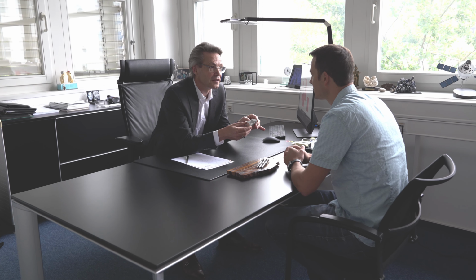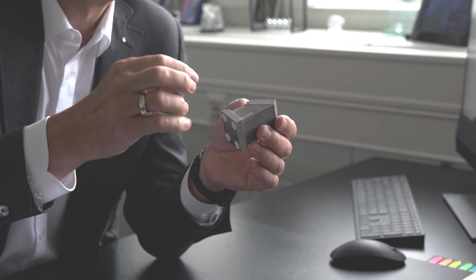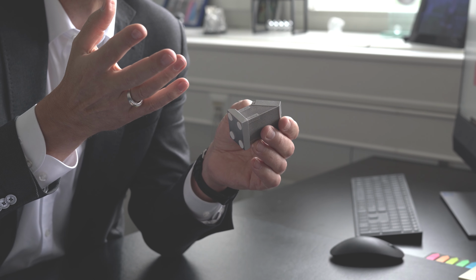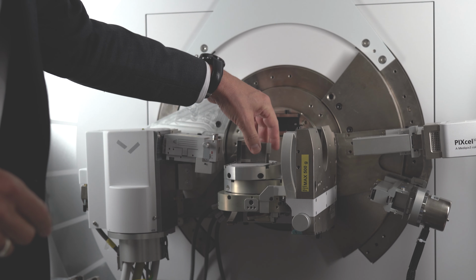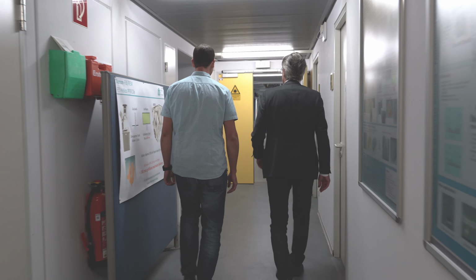The specialty of my institute is that we work on characterization of the microstructure in advanced materials, and we characterize the microstructure in the micrometer scale, as well as in the nanometer scale, and even in the atomic scale. And this gives us a very complete insight into the microstructure, and it allows us to find relations to properties on one side and to the processing on the other side.